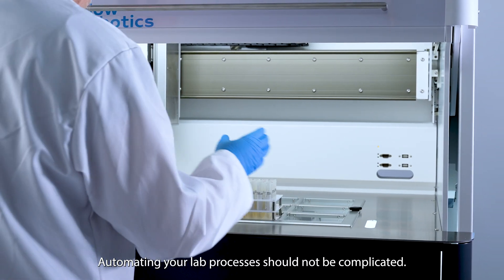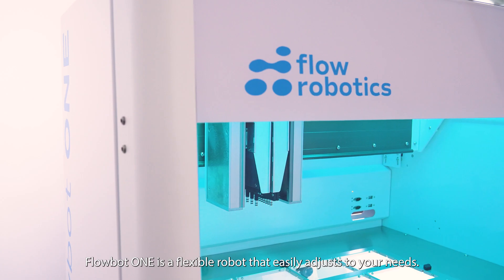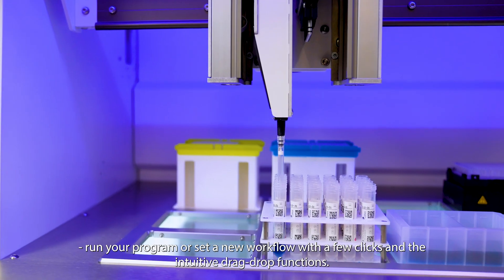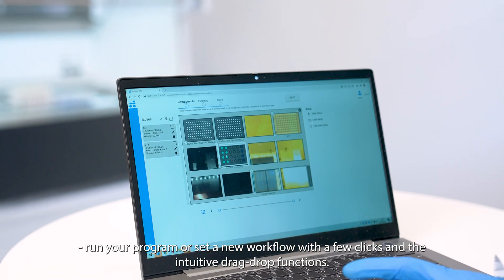Automating your lab processes should not be complicated. FlowBot One is a flexible robot that easily adjusts to your needs. Connect to FlowBot One from your laptop or tablet, run your program or set a new workflow with a few clicks and the intuitive drag-and-drop functions.